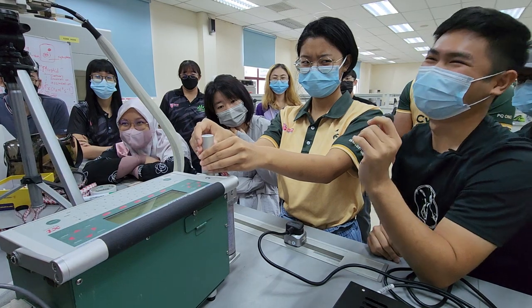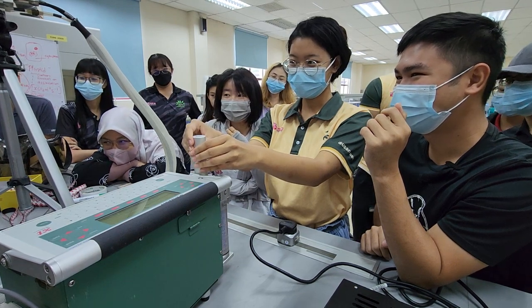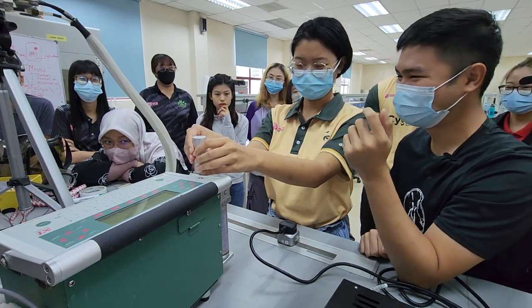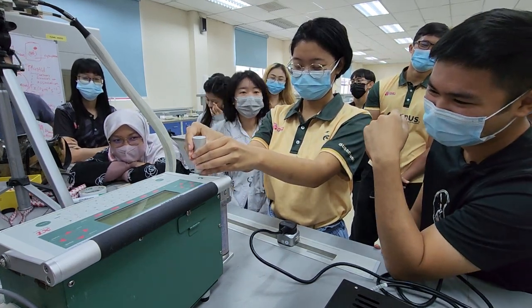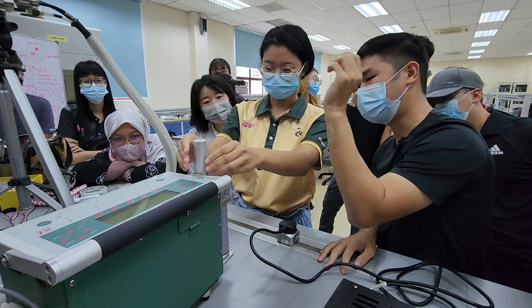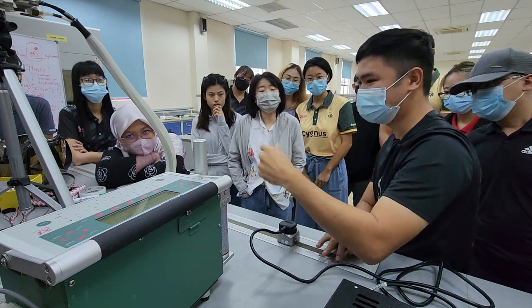Twist it, and when you feel it get tight, turn slowly, because if this is not installed properly, it will explode. After you have the resistance, then twist one go, very quickly, very fast. Maybe you should be far away from it. It will burst, but not very big. Okay, when you feel it is a bit tight, after that what you need to do is twist it quickly, fast.